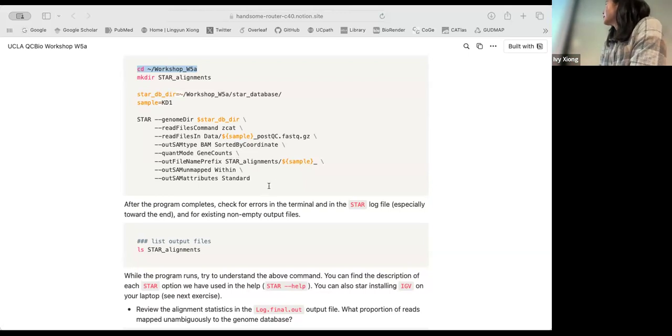So they have this flag, and it says the default is 14. The input should be an integer, and that's the length of the SA pre-indexed string. I think it's a way to decide how big a chunk of nucleotides you are searching in one go. And it makes sense that the longer it is, the more memory it takes.